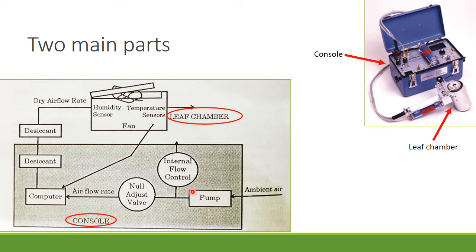This division is essential in the system for leaves with different transpiration rates. The leaves with different transpiration rates must be measured, and controls on the flow rate entering the chamber will be necessary to maintain the relative humidity at the set point.